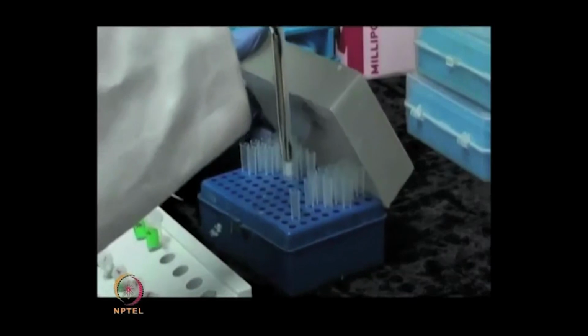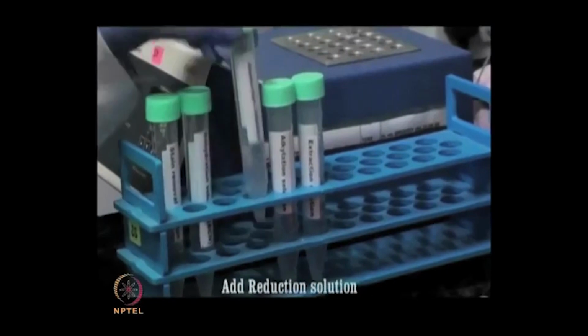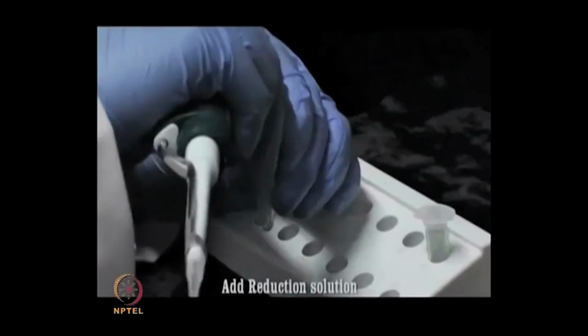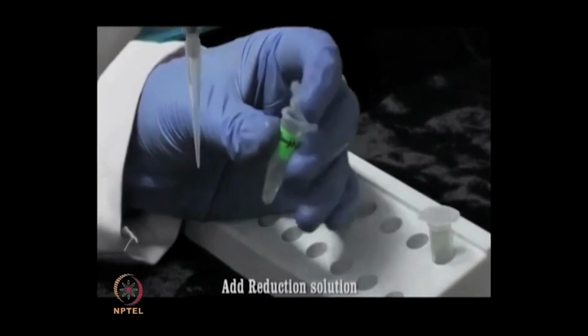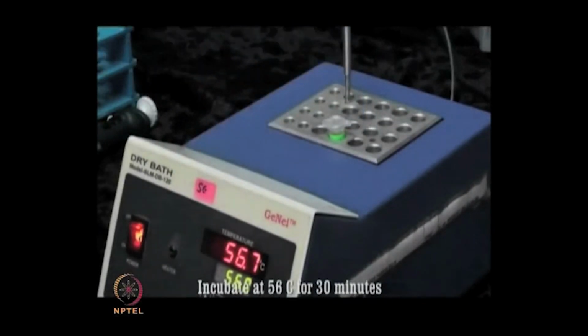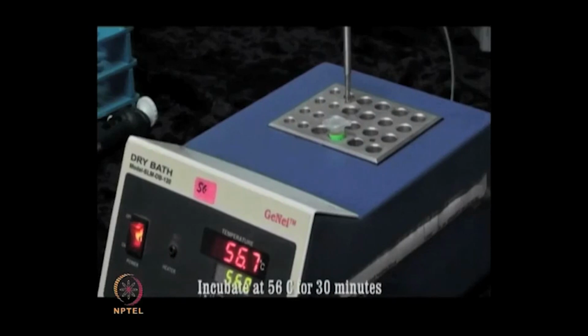After removing the solution completely, then add reduction solution. So, add 30 to 50 microliters of reduction solution to completely cover the gel pieces. Incubate it for 30 minutes at 56 degrees centigrade. Now, treatment of protein residues with dithiothreitol breaks the disulfide bonds.